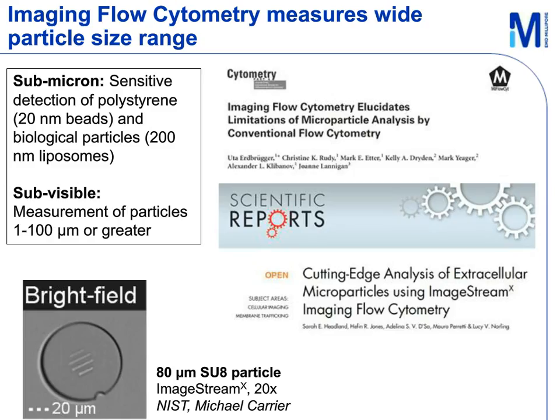This particle was developed in order to evaluate the sensitivity of image-based methods by their ability to resolve 4 microchannels of decreasing size that have been imprinted onto the center of the particle. If you inspect the image, not only can you see that this large particle has been imaged in clear focus on the ImageStream, but each of these 4 microchannels can clearly be distinguished by eye. Overall, I think this is an excellent example of how imaging flow cytometry allows sensitive measurement of small and large particles simultaneously, accommodating the 2 to 100 micron size range of interest for analysis of protein therapeutics within pharmaceuticals.